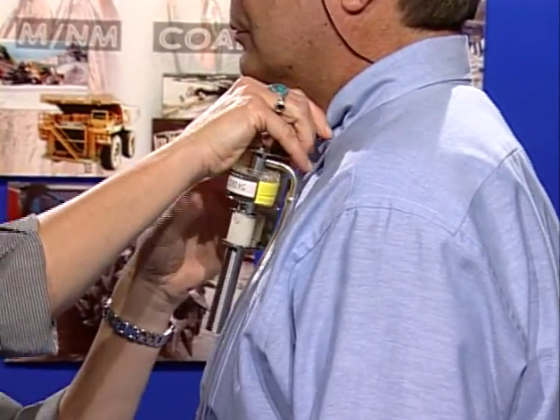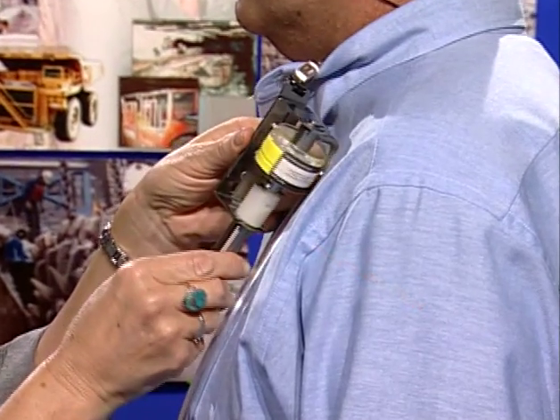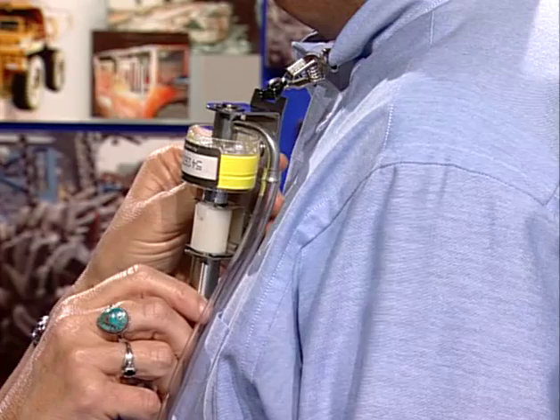Another potential problem is the orientation of the cyclone. As you can see, the inlet of the cyclone is quite small, and it must be pointing out and away from the miner being sampled. If the opening is turned into the clothing, the sampling result will not be representative of what the person was breathing — another ruined sample.